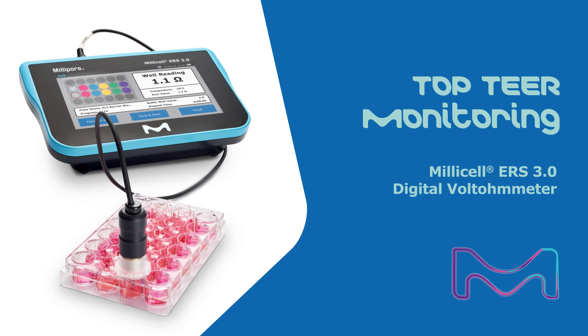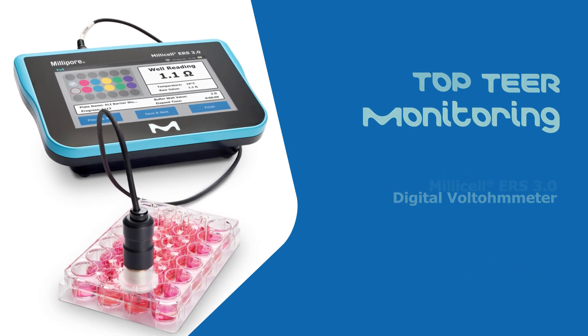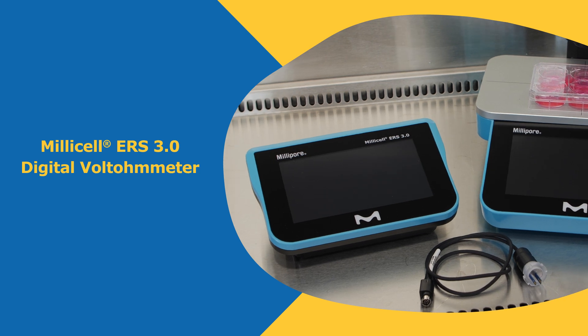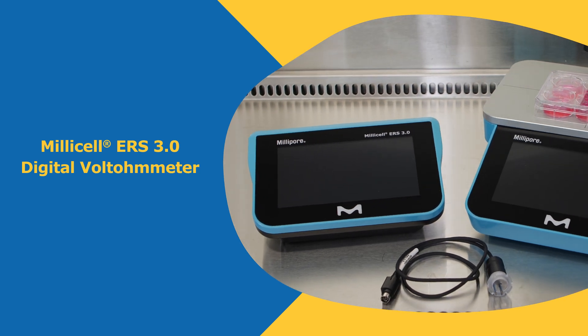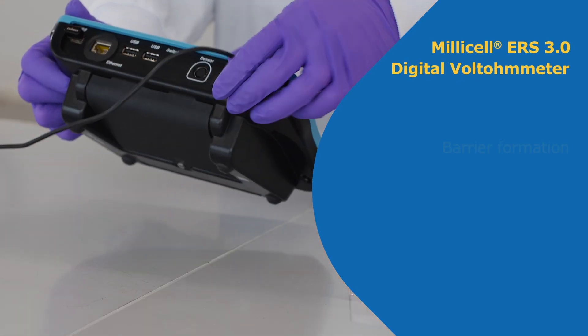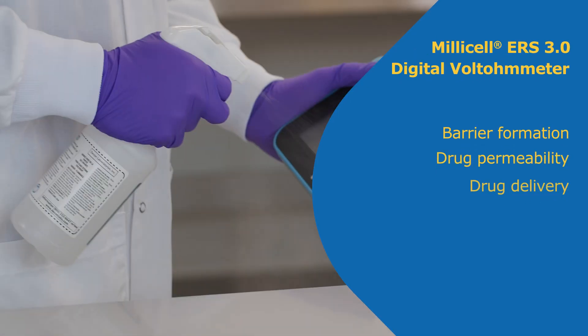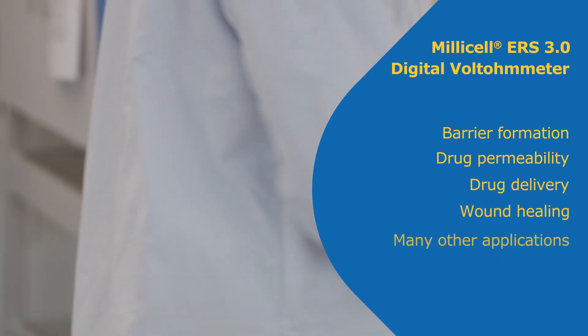Experience the better way to TEER with the Millicell ERS 3.0. The Millicell ERS 3.0 digital voltmeter can be used in a variety of transepithelial electrical resistance applications, including barrier tissue integrity, drug permeability, drug delivery, wound healing, and more.